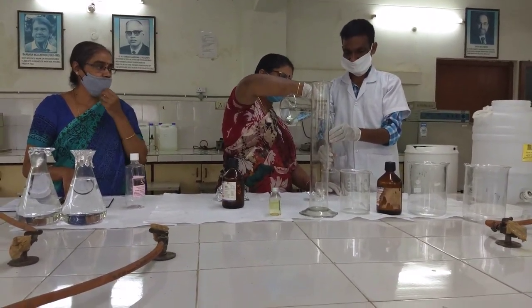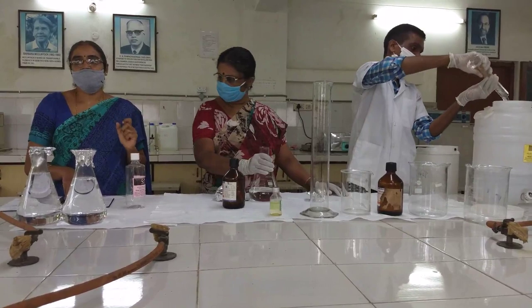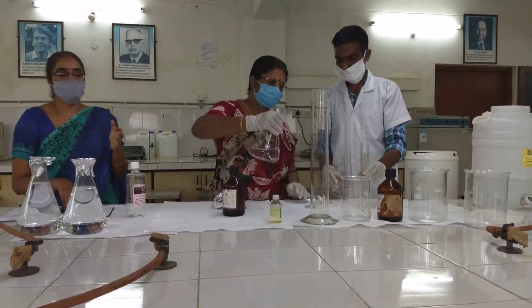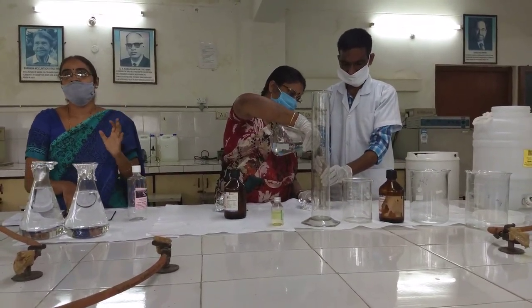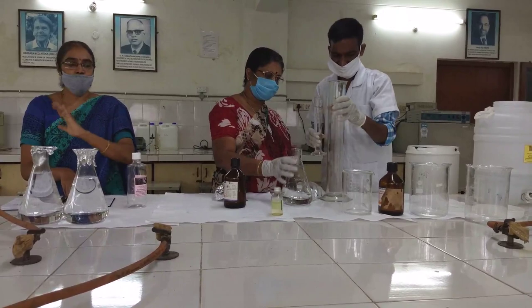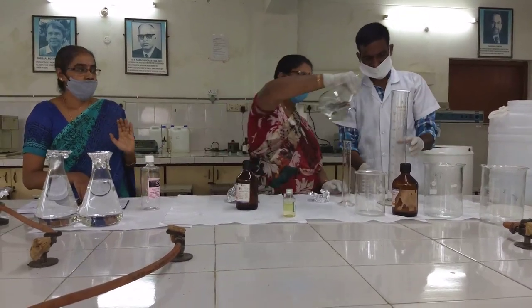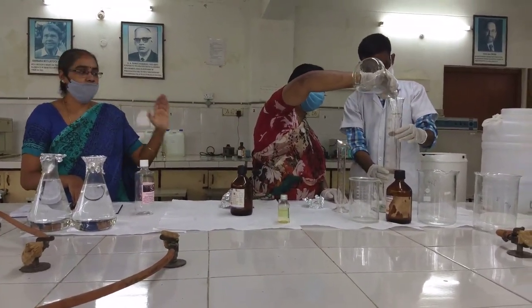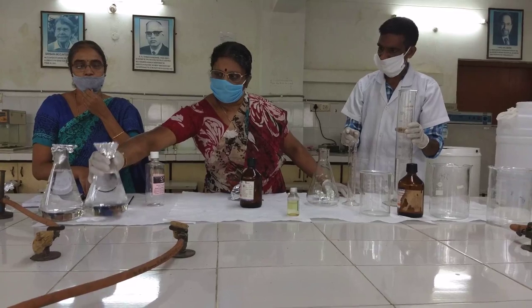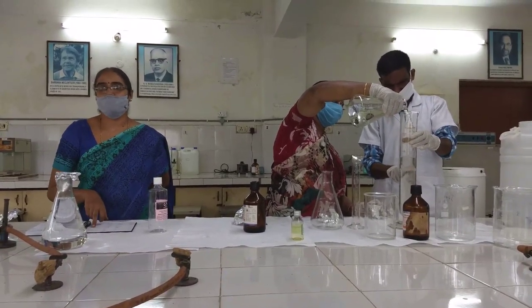200 ml of distilled water has already been transferred. One more point: the water we are using is glass distilled water. The required quantity has been taken, boiled thoroughly by keeping it on the burner, and then cooled. That boiled and cooled water is what we are using for the complete preparation of the hand sanitizer. It is 100% reliable that the hand sanitizer we are preparing is very good, handy, and safe to use for a long time.